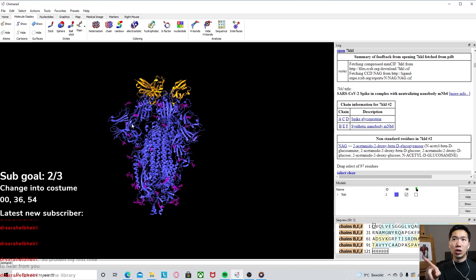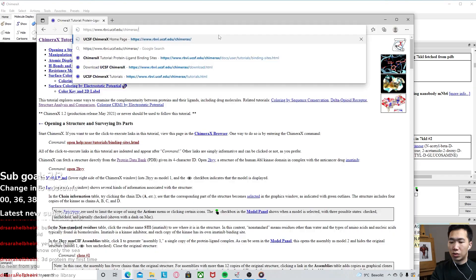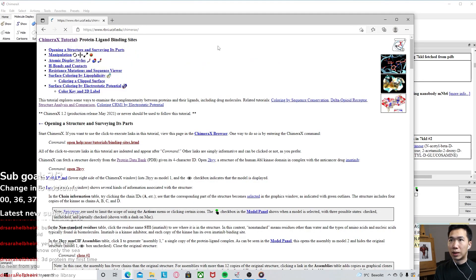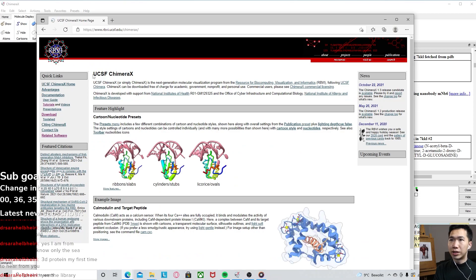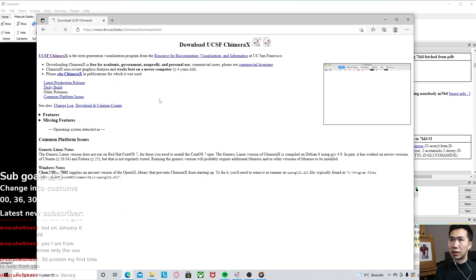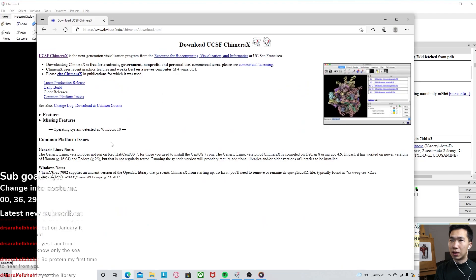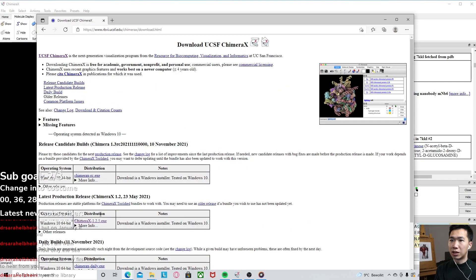If you haven't downloaded ChimeraX, you can go to this website, SF ChimeraX, and then go to download. Then you can download this software for free.